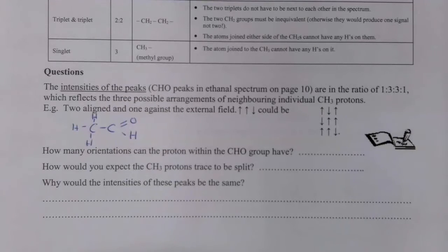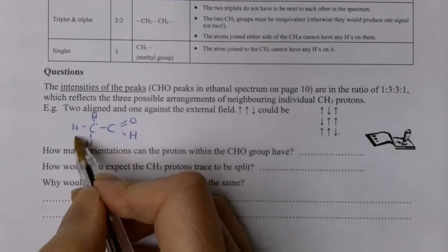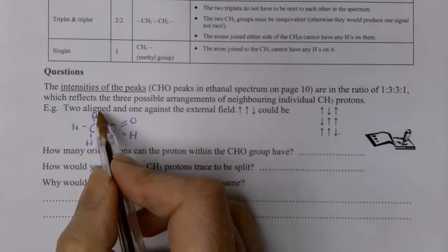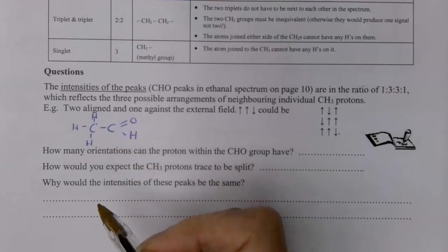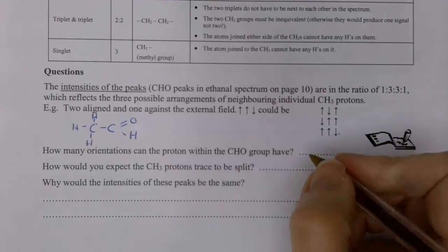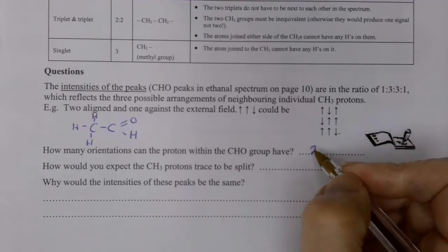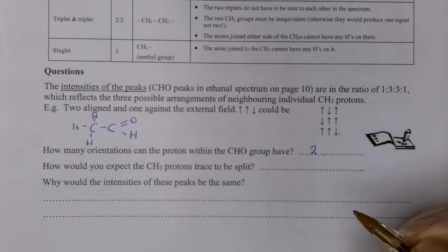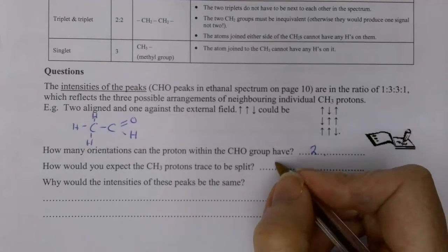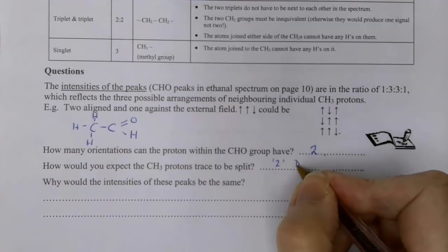And if we look at the splitting pattern, you've got these 3 hydrogens here coupled with this one, so that would be a doublet, and then this hydrogen here coupling with these 3 here, so that would be a quartet. The neighbouring hydrogen can have 2 orientations, basically spin up or spin down, and so the CH3 protons would be split into 2, which we call a doublet.